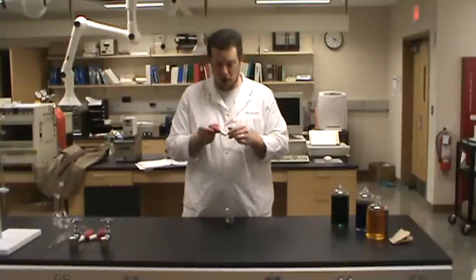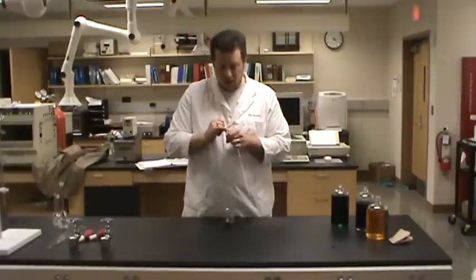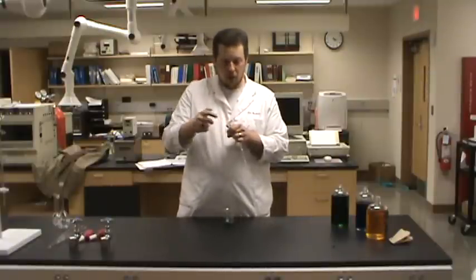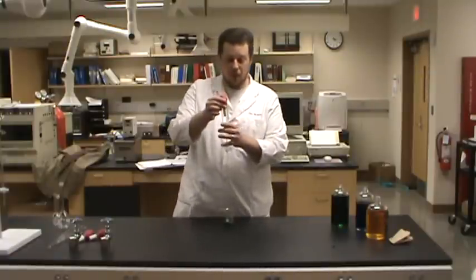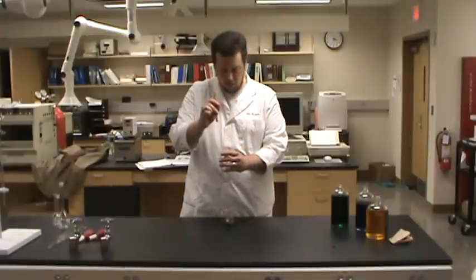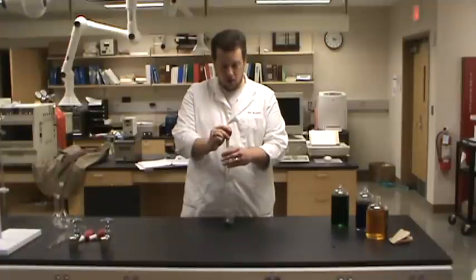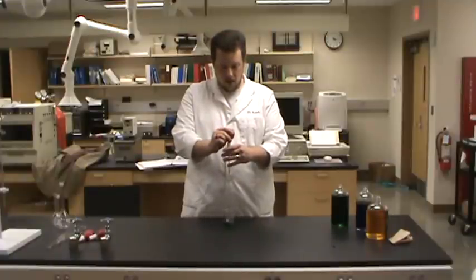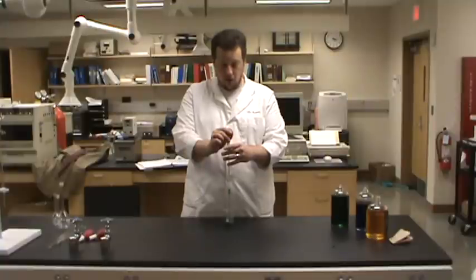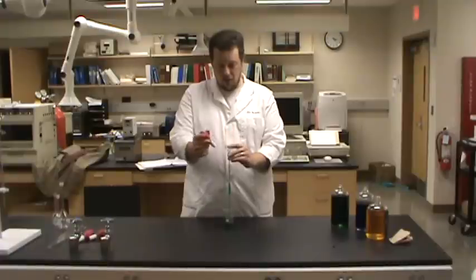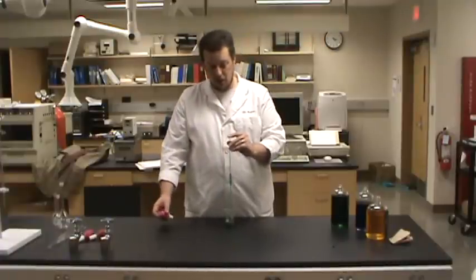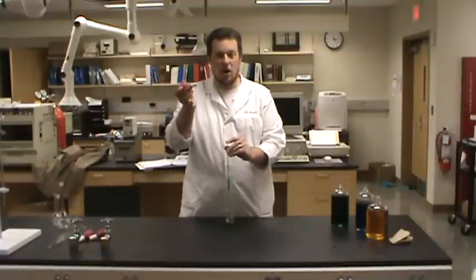Now this pipette bulb, this particular kind has a little rubber insert on the white plastic part that forms a nice tight seal. So we're going to dip the tip of the pipette into our colored liquid and use the pipette to draw it up. Now notice I'm holding on to the pipette bulb because once I get the liquid past the calibration line, I need to take this off.